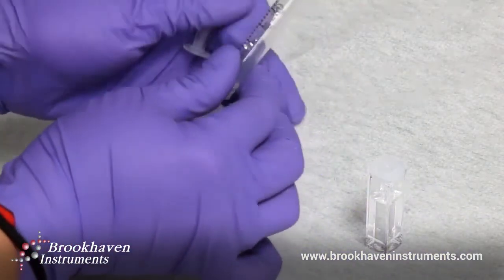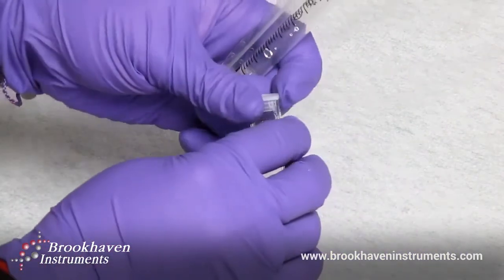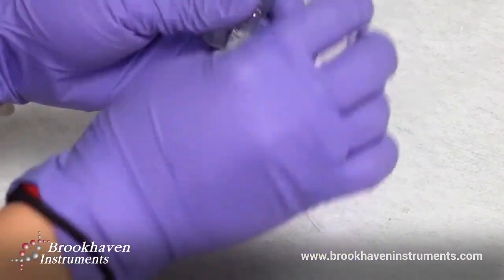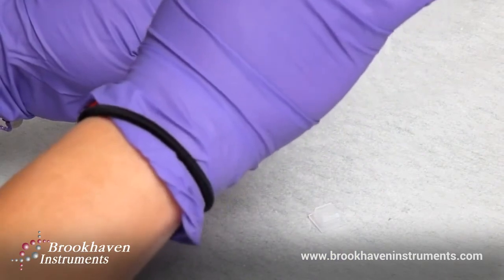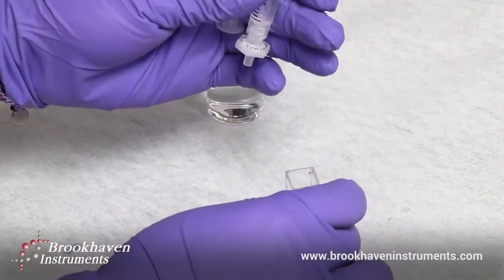In this case, the contaminants and dust particles can be filtered out. For this sample, the best filter size choice is a 0.02 micron filter.